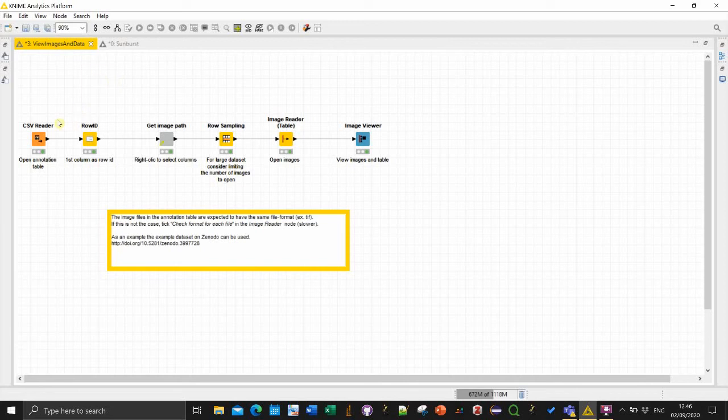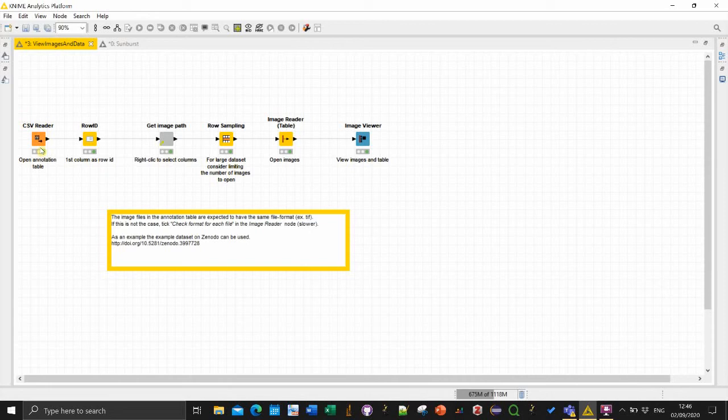So as every workflow it starts from the left to the right. The table is loaded via this CSV reader node. In the other workflow sometimes I use a file reader but the result is the same.